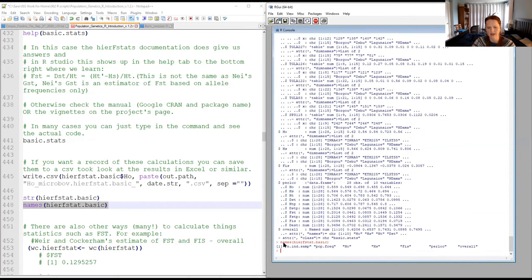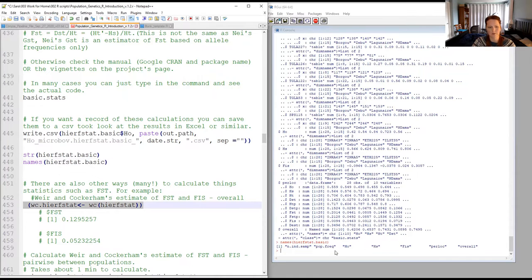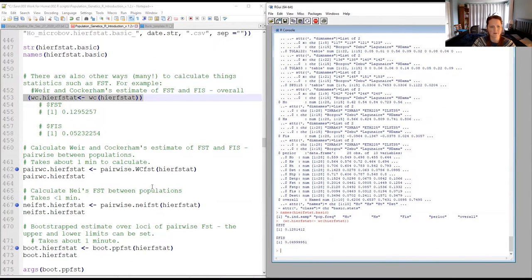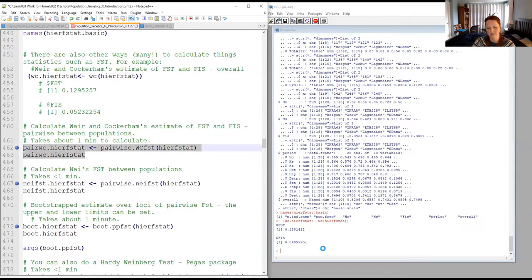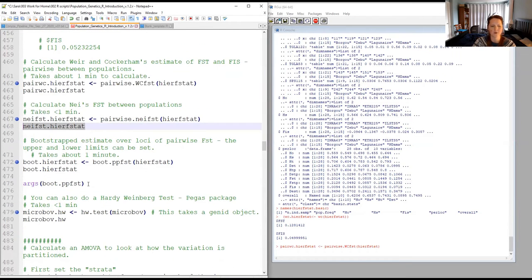If you wanted a record of calculations for a table in your paper, use write.csv(). The hierfstat object has multiple pieces, so you can't call the whole thing — here we call just the observed heterozygosity and write it to a CSV. There are also many other ways to calculate FST: Weir and Cockerham's estimate is available and gives an overall estimate. You can do pairwise estimates, Nei's calculation, and also bootstrapping using the boot command to produce upper and lower limits for your estimate, with adjustable confidence intervals defaulting to 0.025 and 0.975 quantiles assuming a diploid organism.